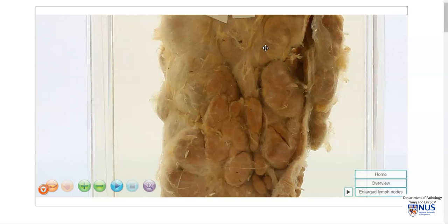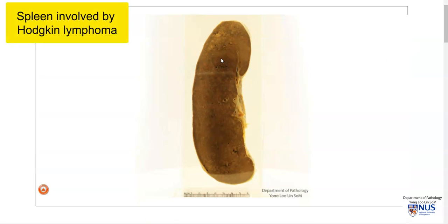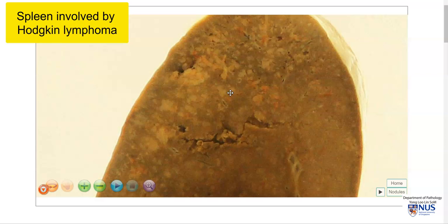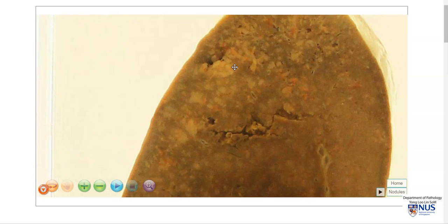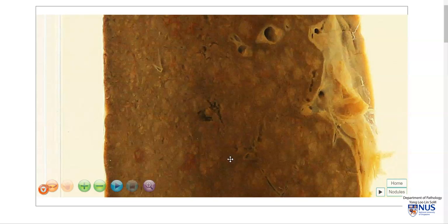Classic Hodgkin lymphoma can also involve other locations other than lymph nodes, and the spleen is one of them. Here is an enlarged spleen, and if we look at higher magnification, we can see that there is no one very discrete obvious mass. However, the splenic parenchyma appears to have these ill-defined, whitish nodular areas that vary quite widely in size, from probably just 1 or 2 mm to perhaps approaching 1 cm in diameter. This is evidence of splenic involvement of Hodgkin lymphoma.